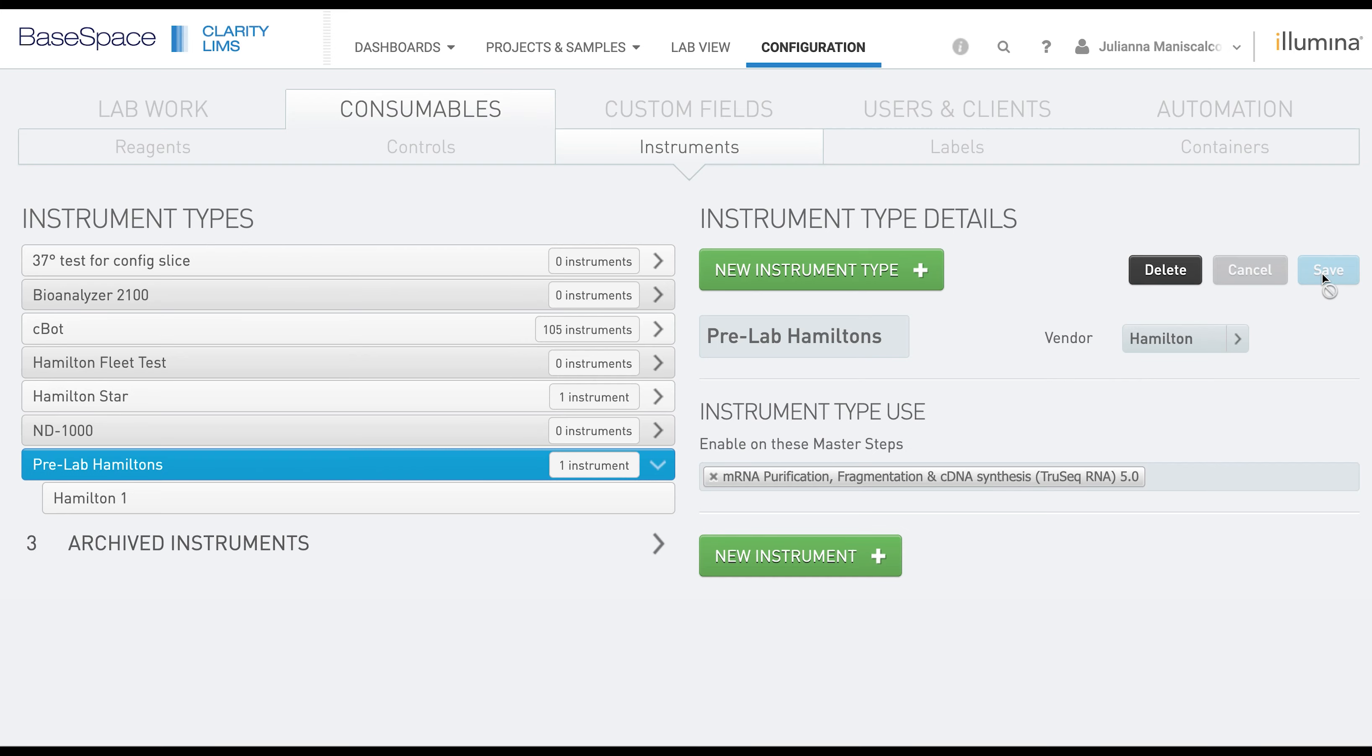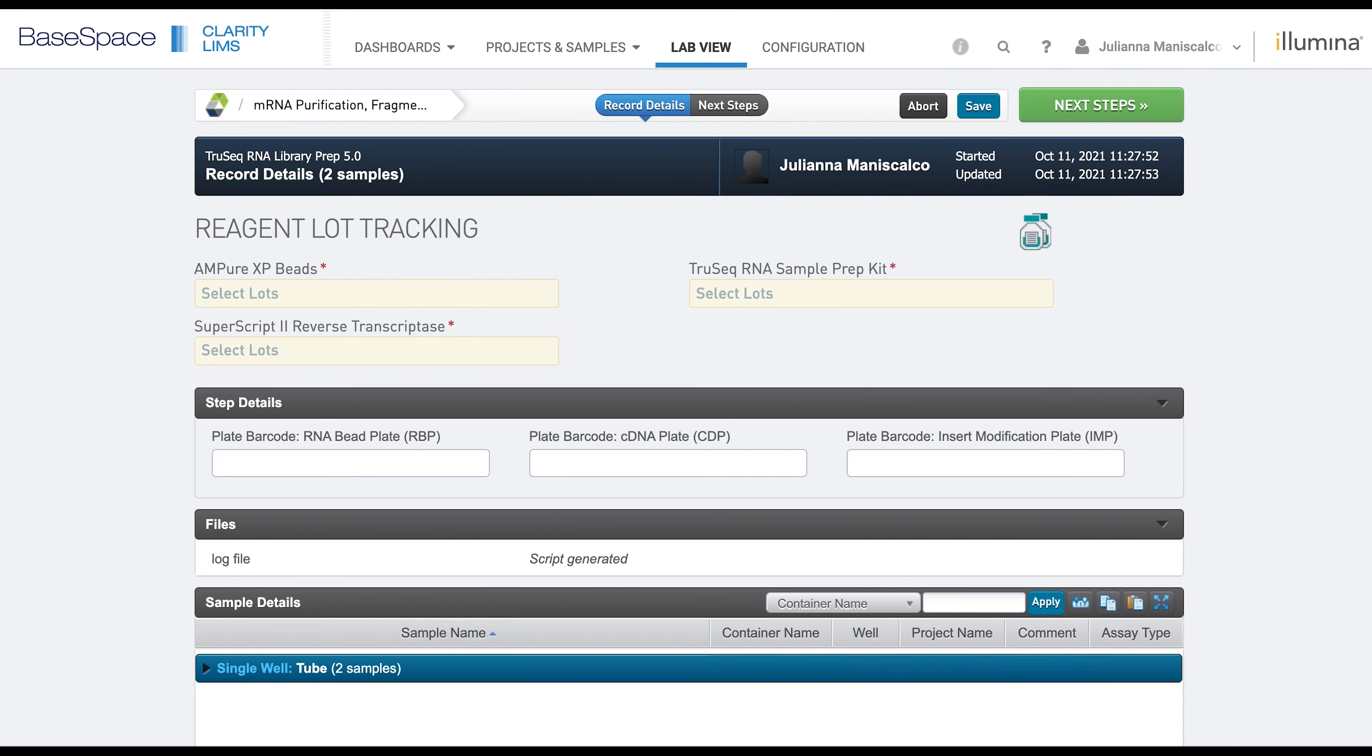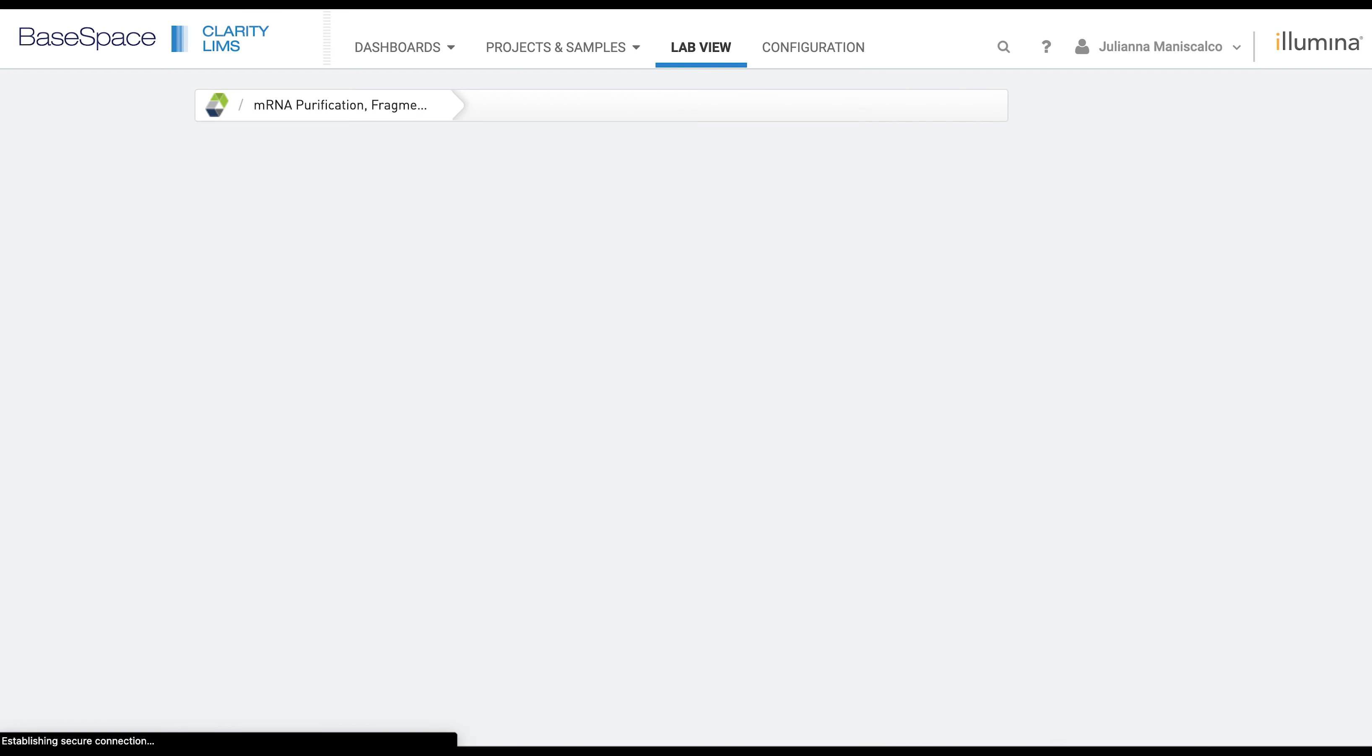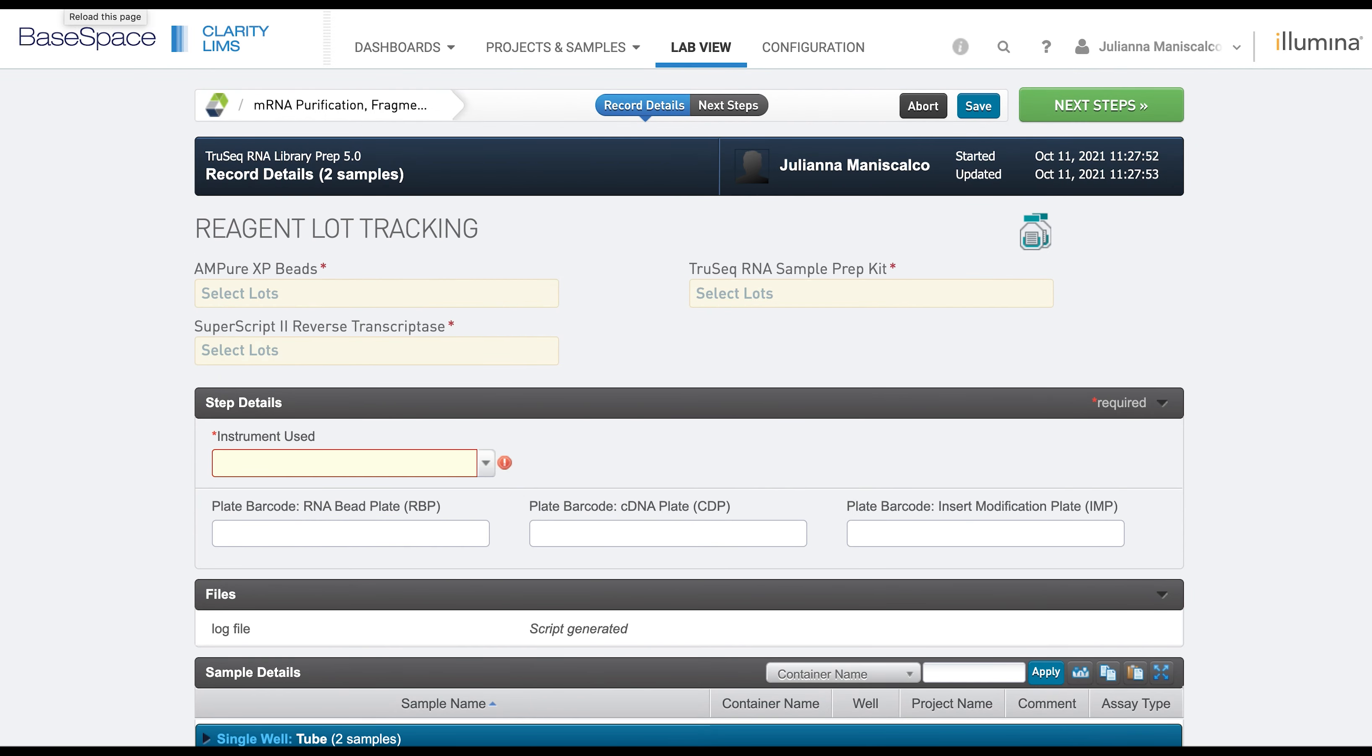Now if we toggle over to the step and refresh, we can see that there is now an option for the instrument used.